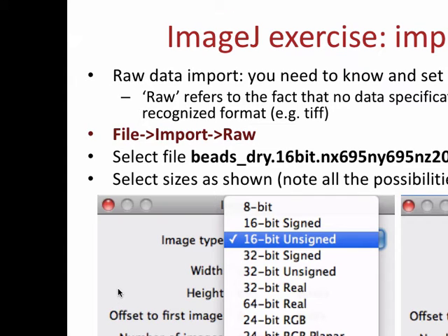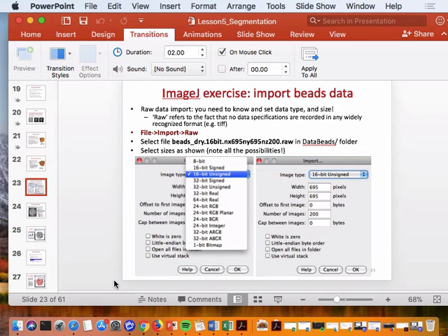Go to it. Yes? When you do filtering, do you think it's more important to spend more time before segmentation, or is it better to do it in post-processing? Or does that always depend? I would remove as much noise from an image by filtering as I can. At the very minimum, a median filter.